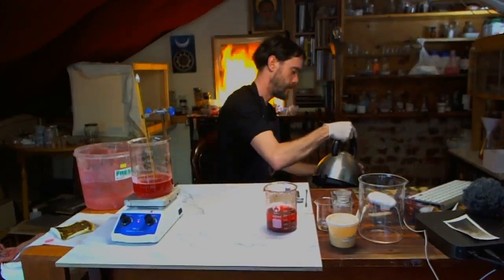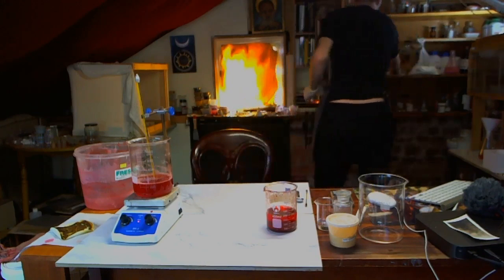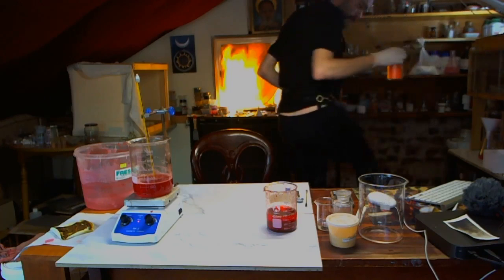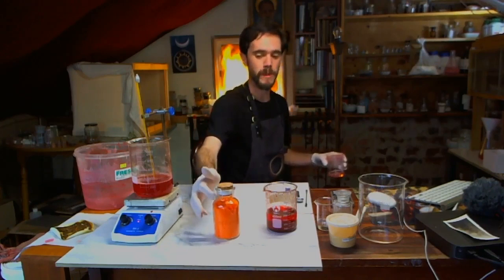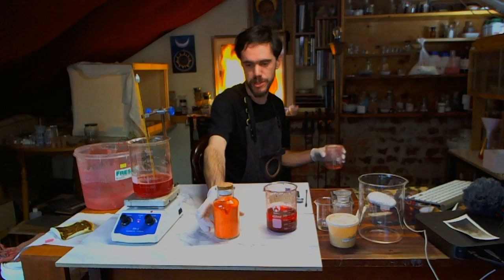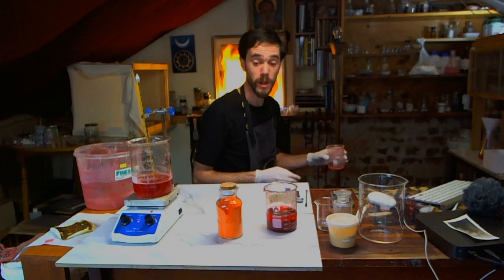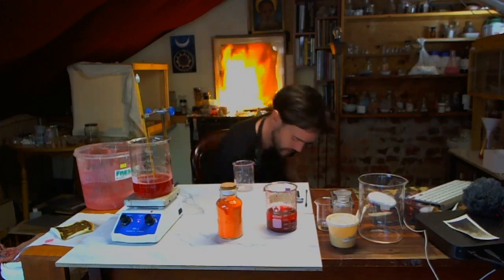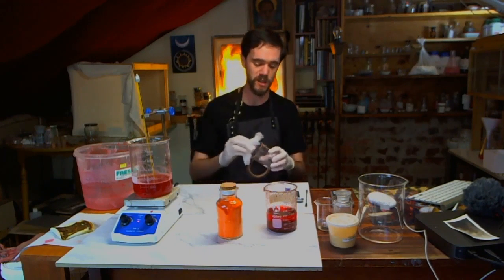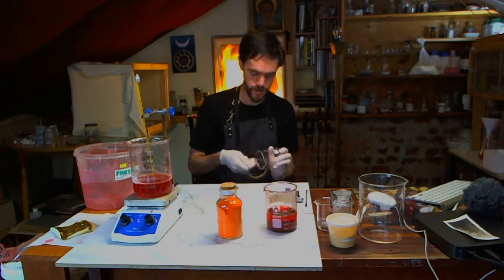Yeah, sodium dichromate. This is potassium dichromate here, but sodium dichromate should look exactly the same. It should just be this orange salt. Just be really careful when working with it because it's a very, very soluble source of hexavalent chromium. So this is incredibly toxic stuff.